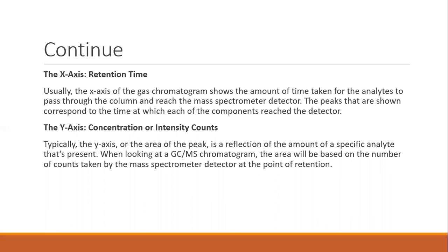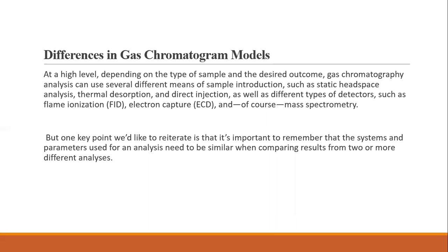The next one is the example. Sorry, this is the difference in gas chromatogram models at a higher level depending on the type of sample and the desired outcome.